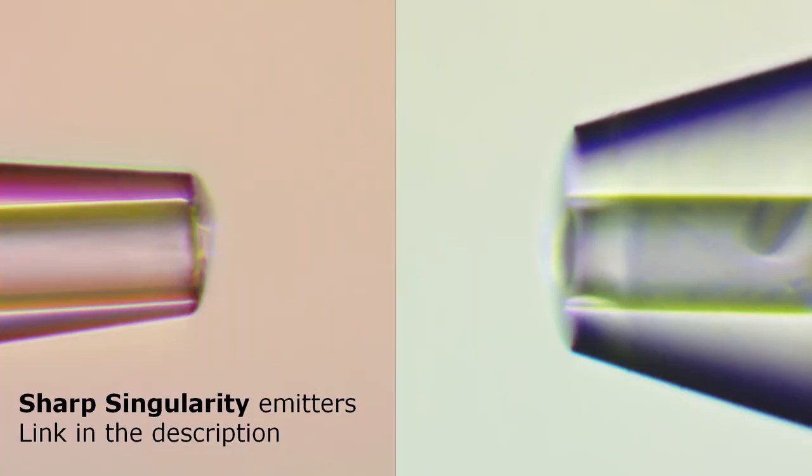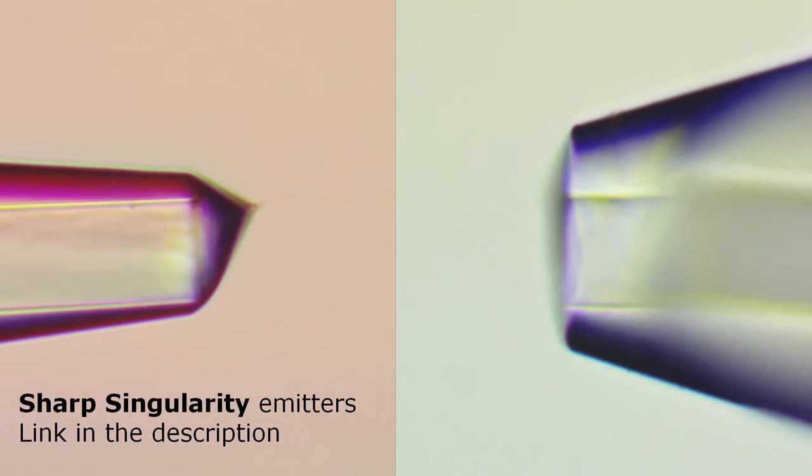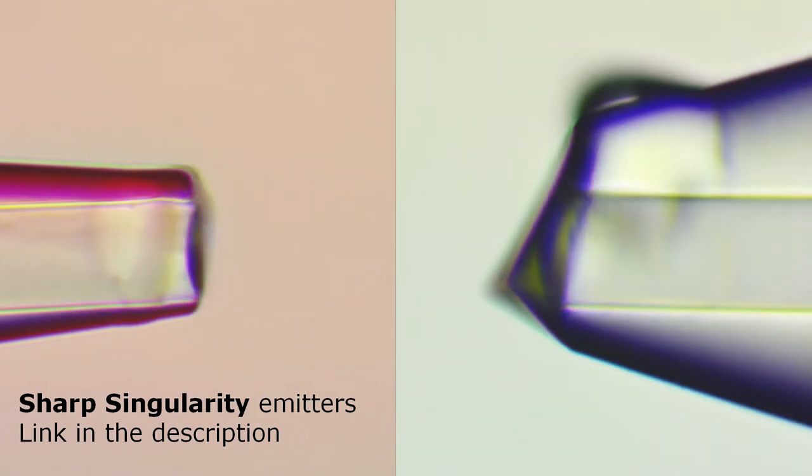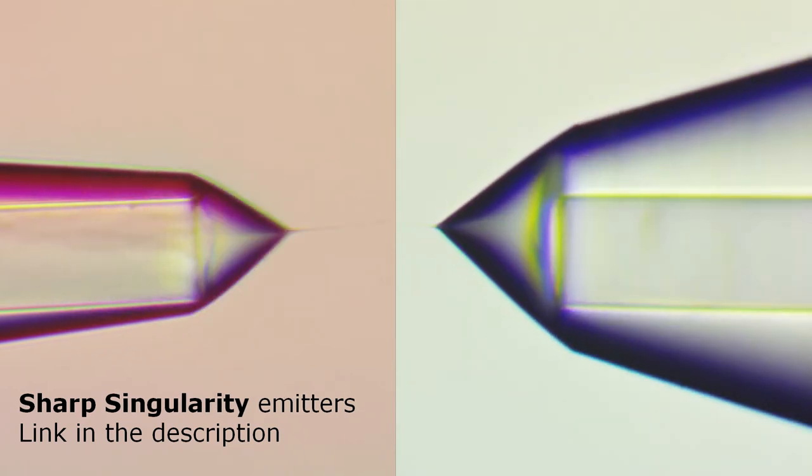Here we have two electrosprays with two emitters, with the same liquid and the same magnification. They have the same inner diameter. The only difference is the geometry. On the left is a sharp conical emitter. On the right, a tapered nano-objective emitter. Here you can see that the size of the meniscus is defined by the outer edge of each tip. The relevant parameter is the size of the meniscus, not the inner diameter of the emitter. The meniscus size and shape are defined by the outer edge of the emitter.